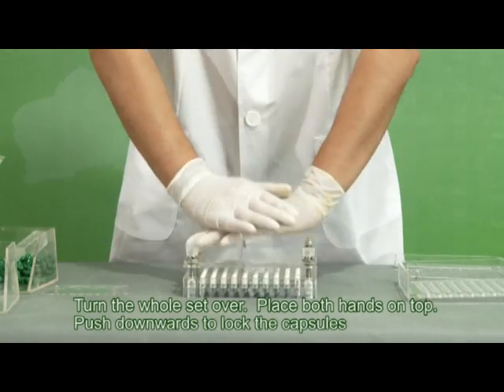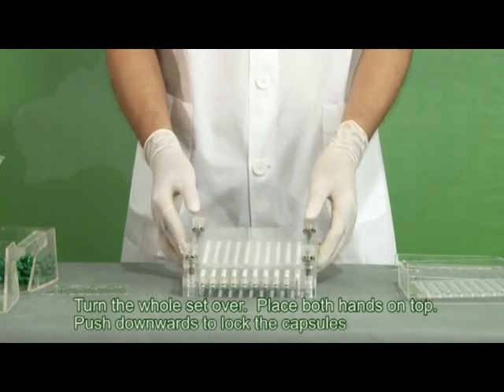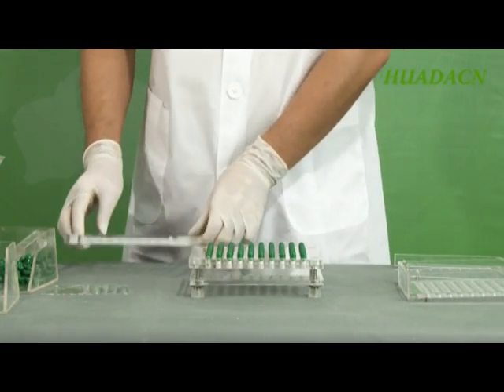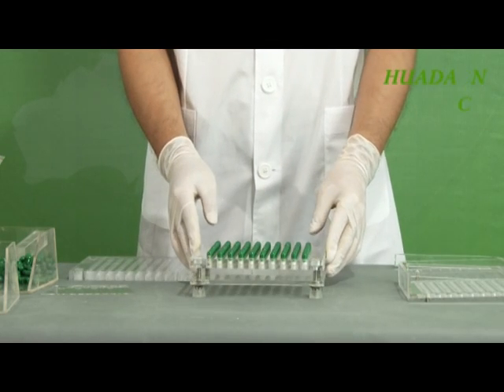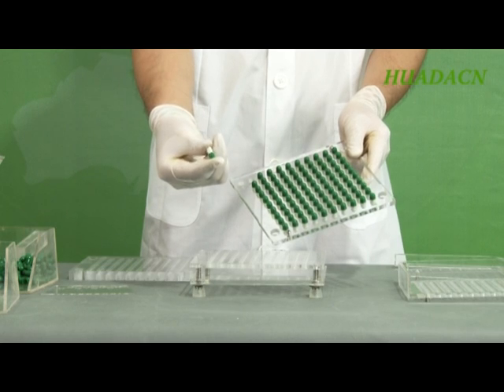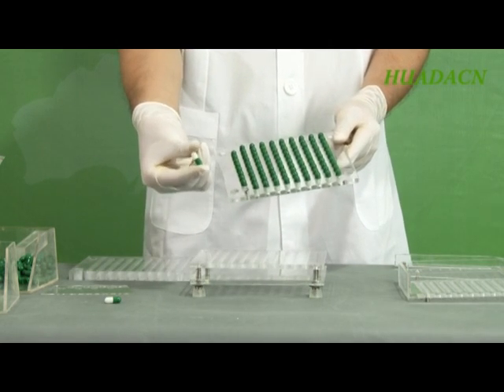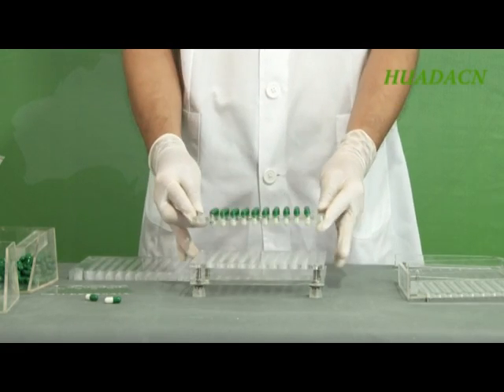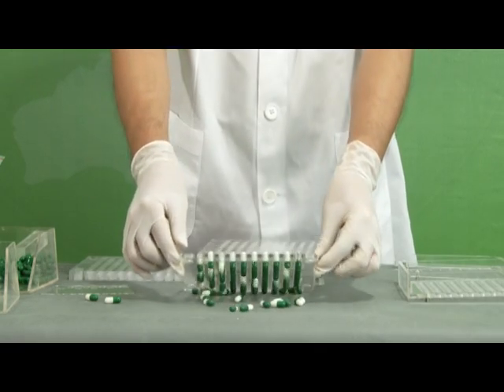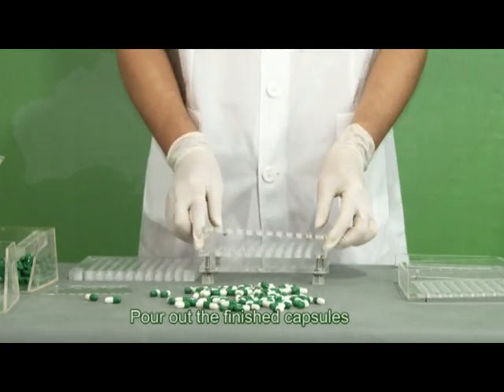Turn the whole set over. Place both hands on top and push downwards to lock the capsules. Pour out the finished capsules.